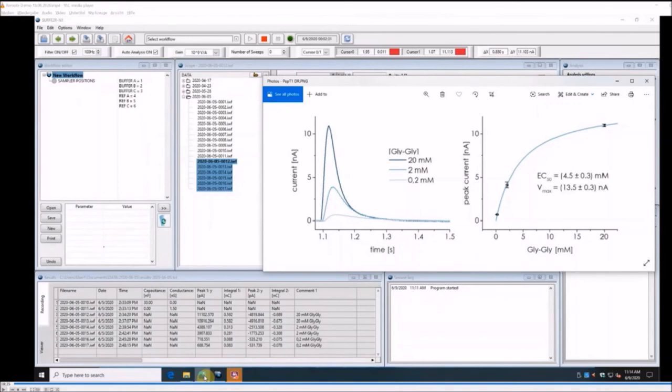Can pH be used for activation? And if so, is it tricky? pH can be used, but the outcome will highly depend on the pH gradient or the pH jump you need for activation. If the change of pH for activation is quite high, then you will also trigger some solution exchange artifacts because protons interact with the membrane itself. If you do so, we highly recommend using a negative control membrane without the protein of interest to figure out to which extent the signal is influenced by artifacts.